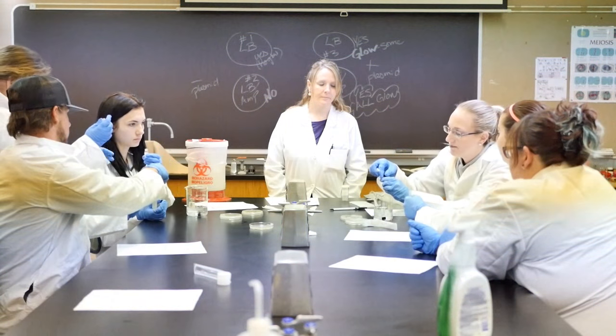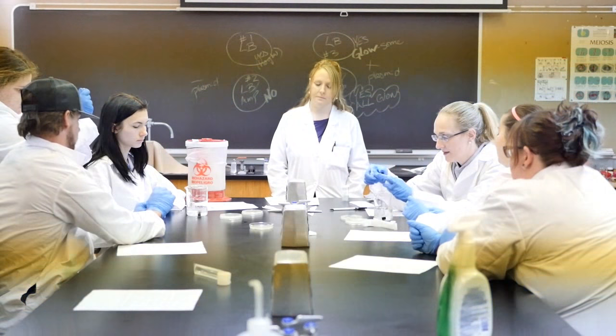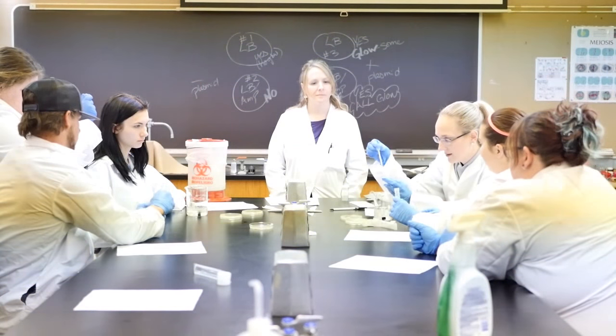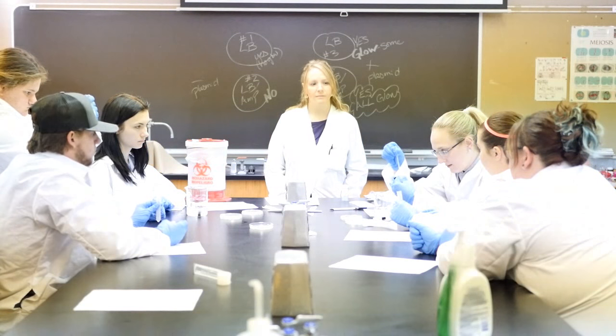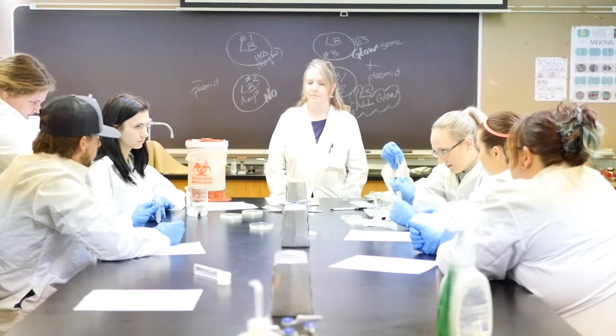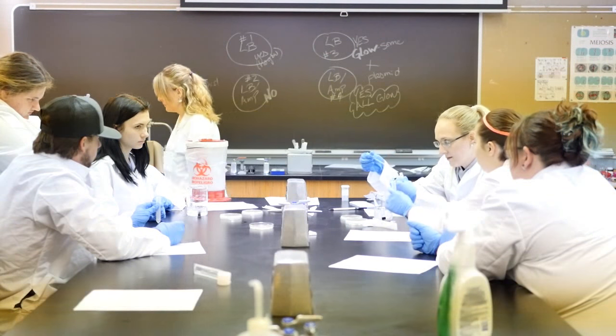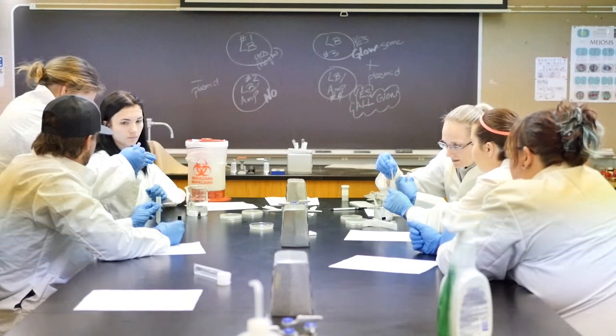Nope. There she pops. I got her. Can't read the label now. You ever read the label on? Can't really see the thing. Which one is 2? Here.